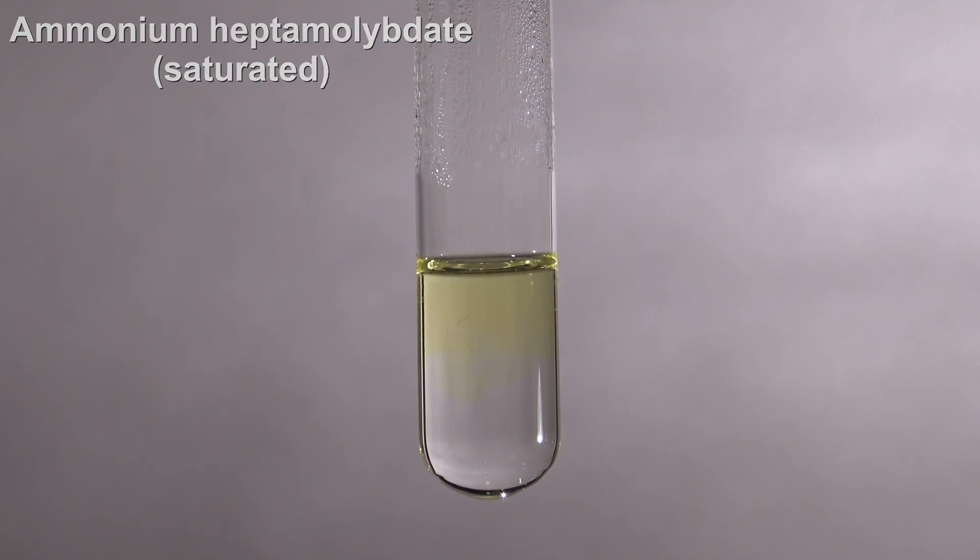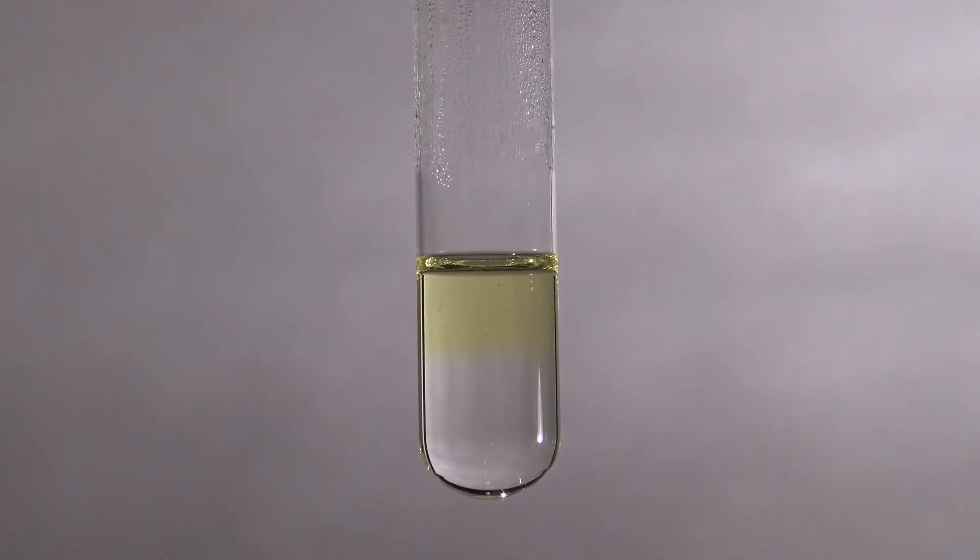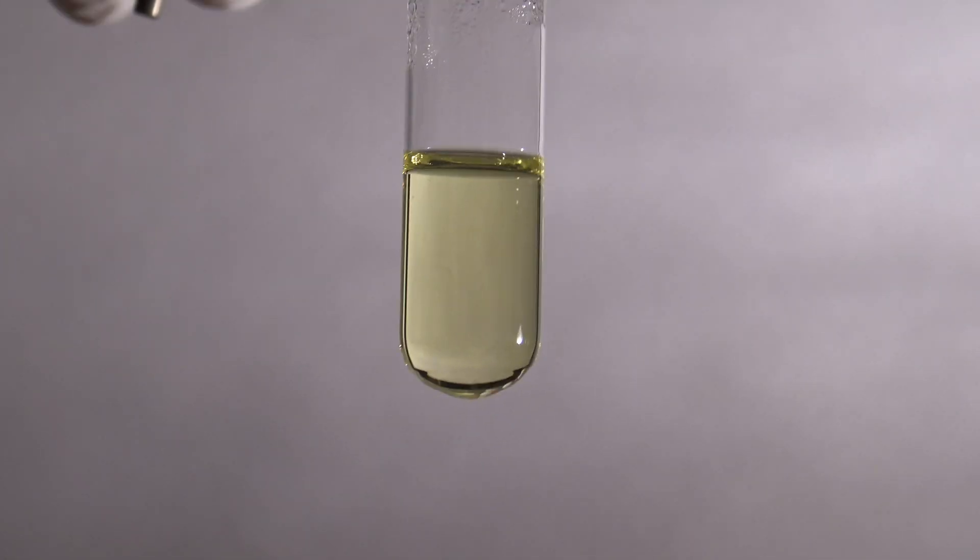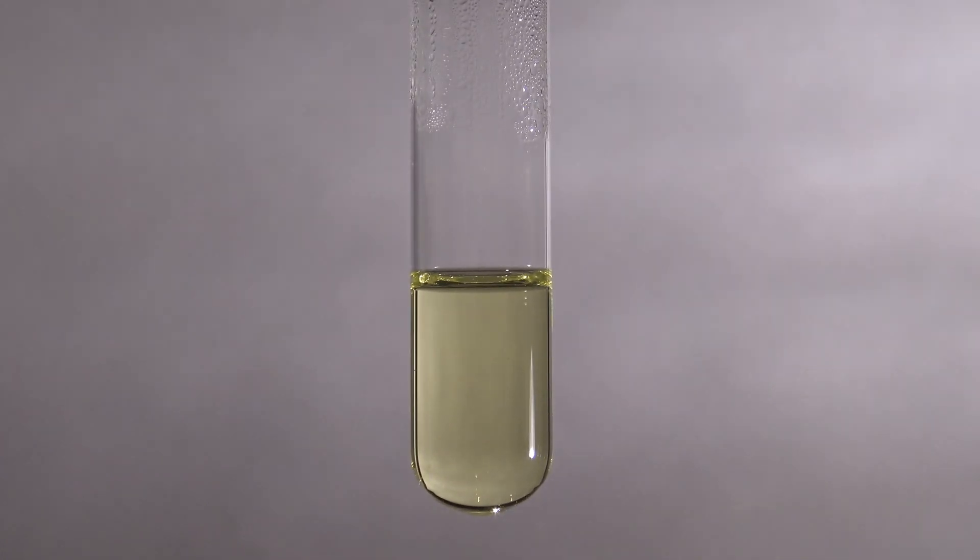The yellow color might be an indication that phosphate is present, but the test is only seen as positive when a yellow precipitate is formed. To force the formation of the precipitate, a drop of diluted ammonia was added.